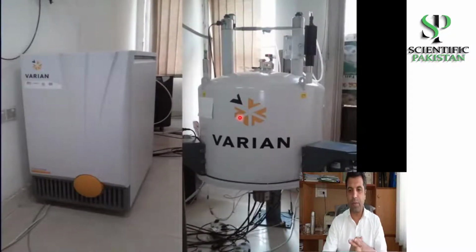And this is a picture of the modern instrument that we have here in the Institute of Chemical Sciences, University of Peshawar. You see this cylindrical type of structure. This is actually the magnet, and right in the center you have the input system. So your NMR tube along with your sample goes inside.